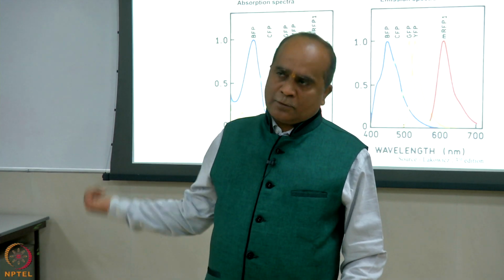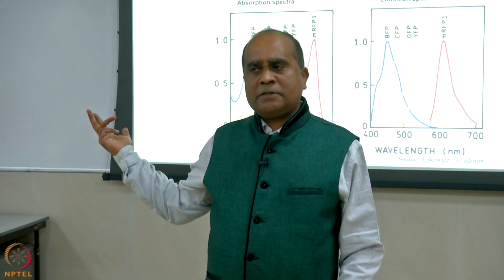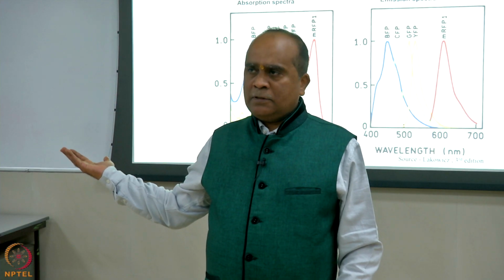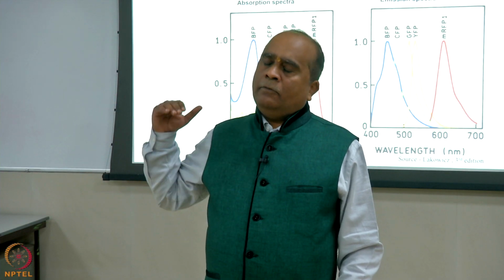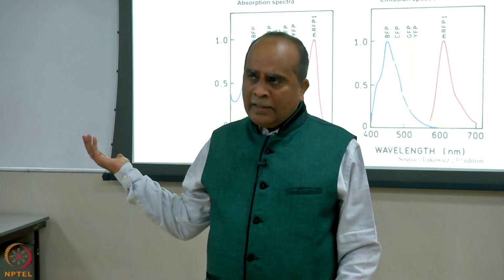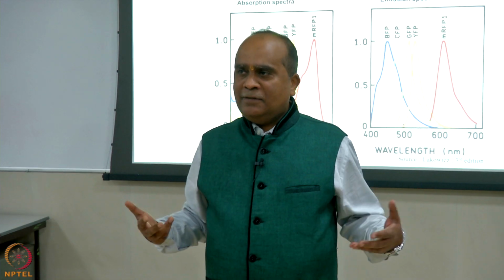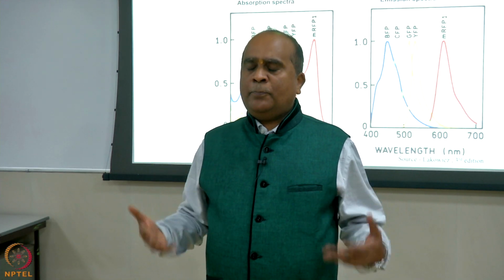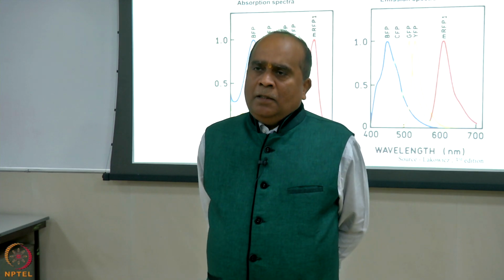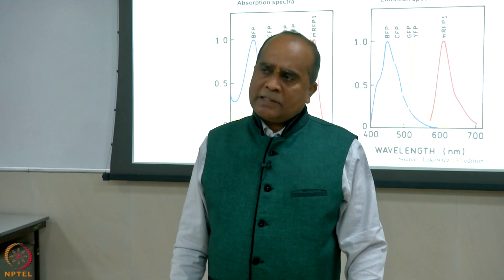Now, confocal microscopy is one of the important tools in biophysics, biochemistry, cell biology and all those. All sorts of microscopy are important tools to understand the wonderful phenomena that are happening inside the cell. Otherwise, we had no way to know what is happening inside the cell. Now, we can send some reporter molecule which can report what is happening inside the cell, right. So, that is all from the fluorescence and its application.